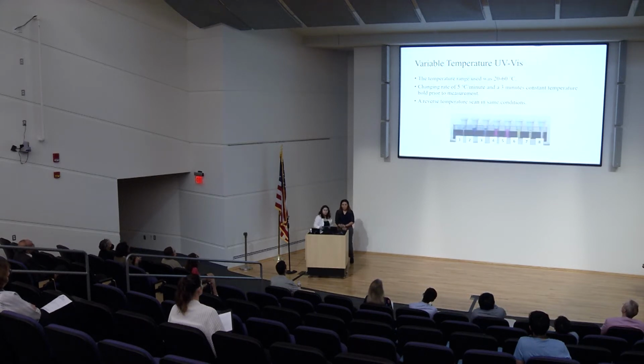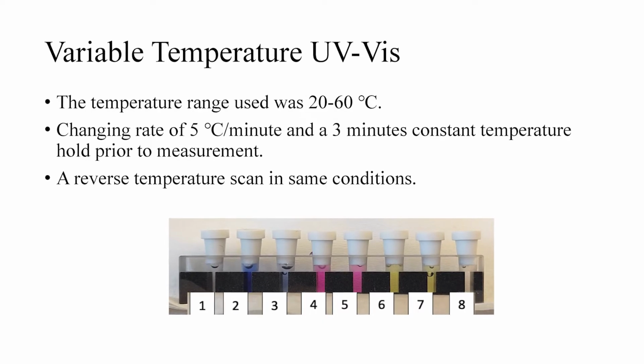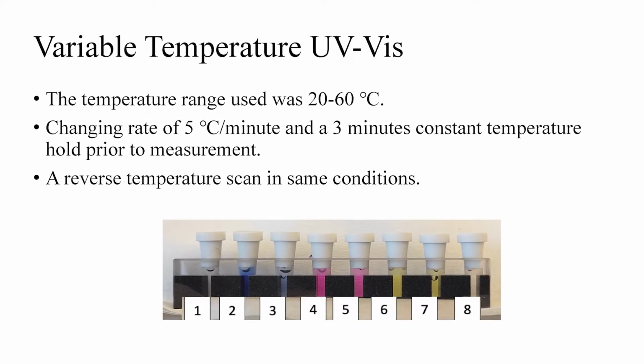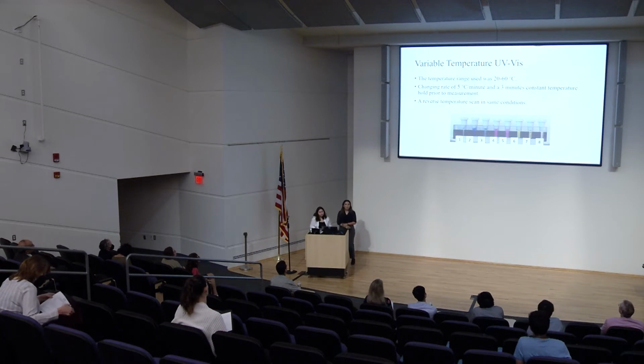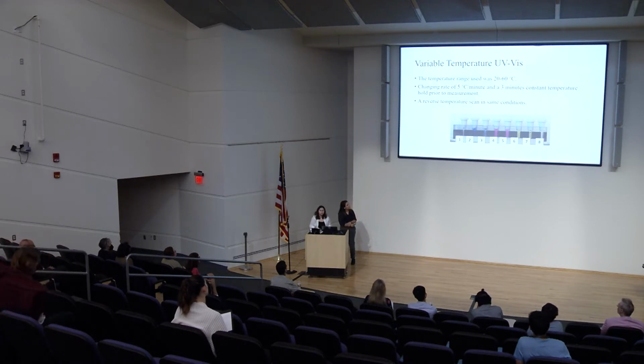Yeah, and again, for the last run, which is the one that is going to give us the thermodynamic values, this is the setup that we used. We did a range between 20 and 60 Celsius, and the most important in here is going to be the hold time. We wanted a hold time that was long enough for the temperature to get even throughout the 8-cell cuvette, as you can see here. But since it only holds 100 microliters, it didn't need to be like 10 minutes or so. 3 minutes should be just fine.